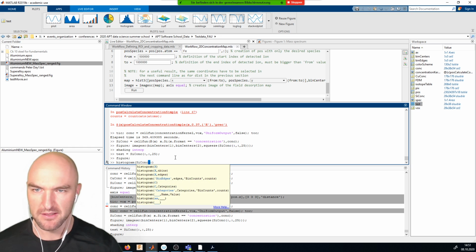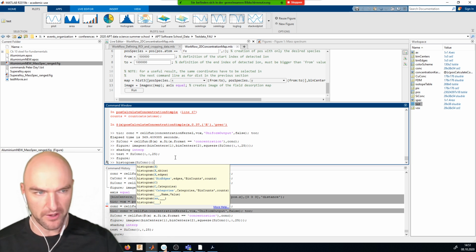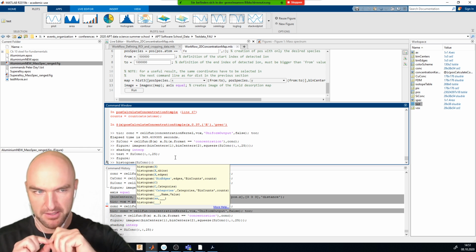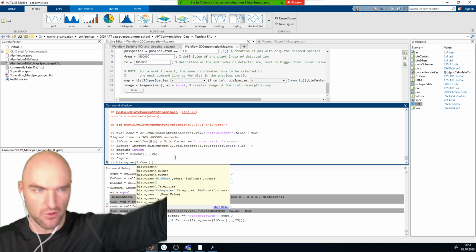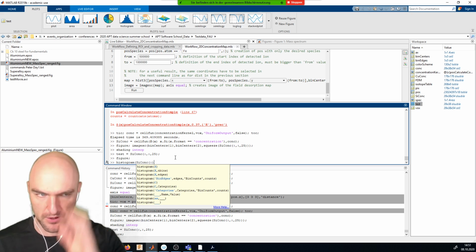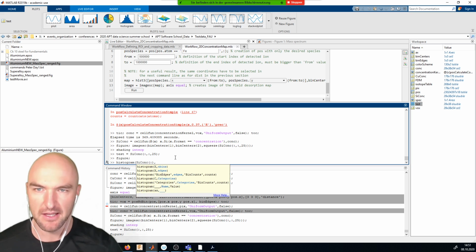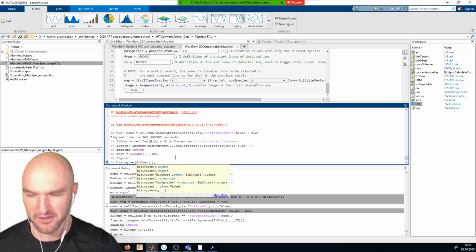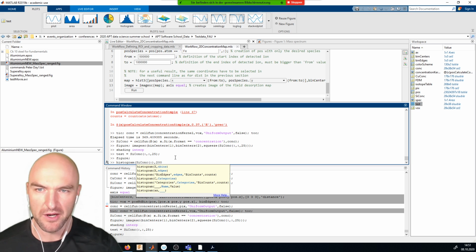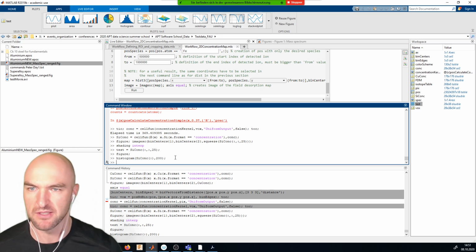And now what you can see is that I used only the colon and not the 3 entries. And this means MATLAB, please take the whole 3D array as a 1D array. Otherwise it will try to do a histogram in all 3 dimensions, which is nonsensical in this case. I've got a lot of bin values, so I can probably do that with, I don't know, 200 bins or something like that. I can explicitly define the bin edges, but I'm too lazy for that now. We will see what the bin edges are anyway.